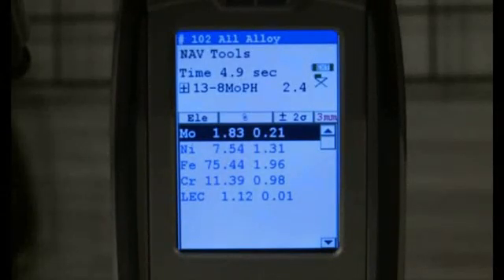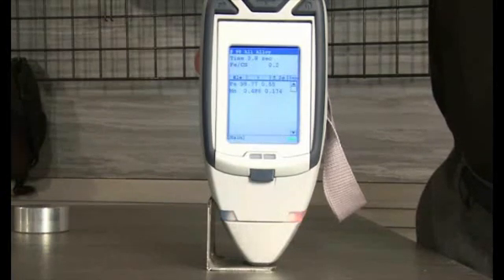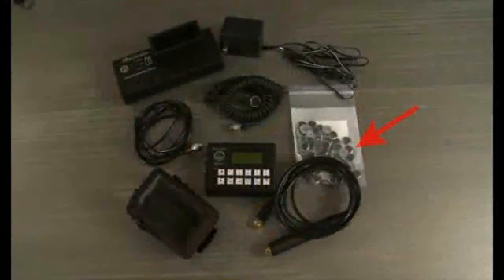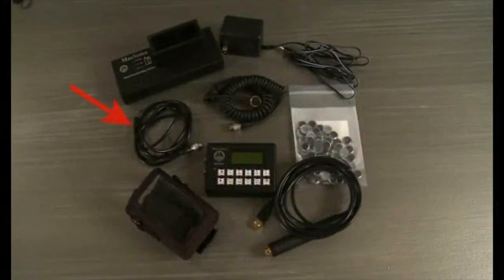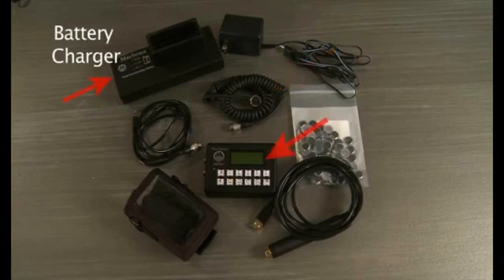When we test the base material, we see it as pure iron or carbon steel. Any iron or steel containing only carbon as the alloying element will be identified as iron, carbon, steel to indicate that we cannot test for carbon, and therefore do not distinguish between pure iron and steel with carbon content. The electronic position indicator, or EPI, consists of the following components: The EPI buttons for recording information, the serial cable connector, button link, EPI button reader.